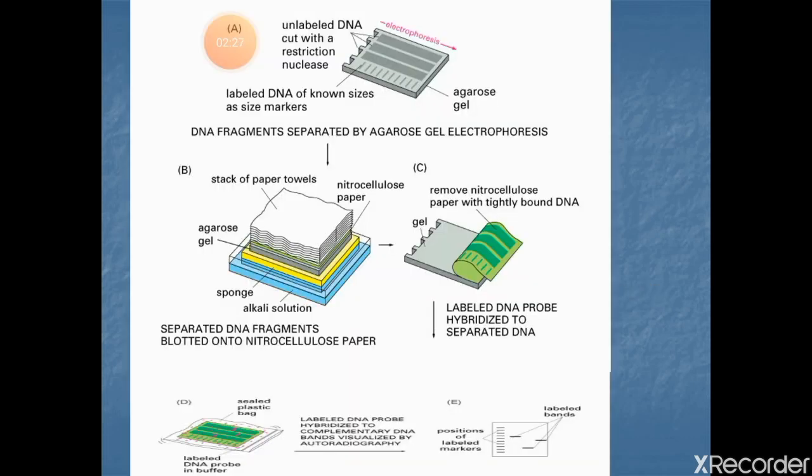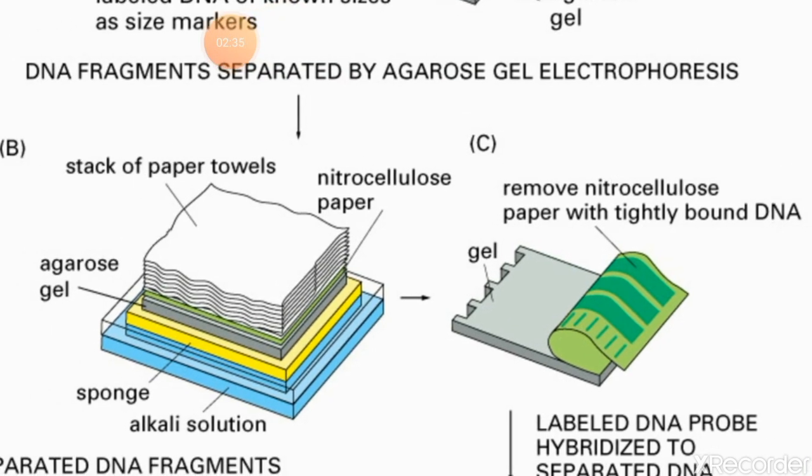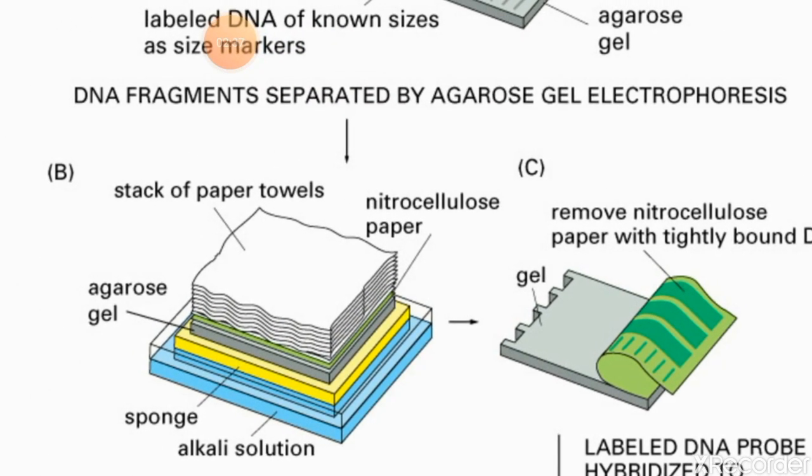Here you can see the nitrocellulose membrane. The nitrocellulose membrane is kept on top of the agarose gel, and a stack of paper is kept on top of that, that is Whatman 3 mm paper. The nitrocellulose membrane is getting blotted with the gel. Whatever DNA pattern is on the gel after running the electrophoresis is transferred onto that membrane. So we are getting just a replica of that.